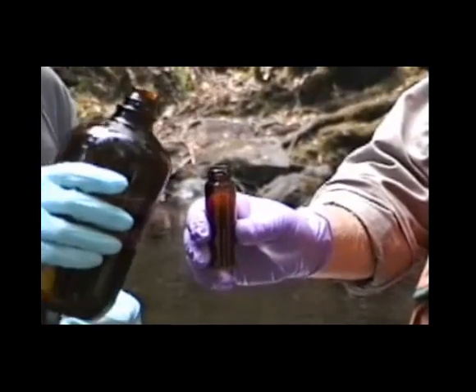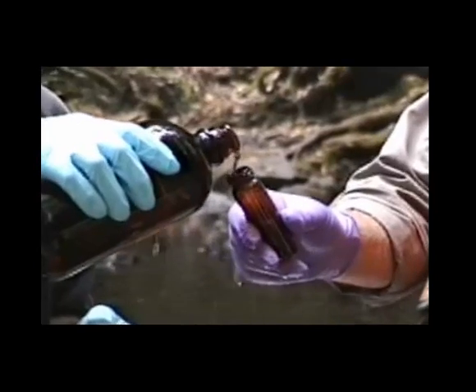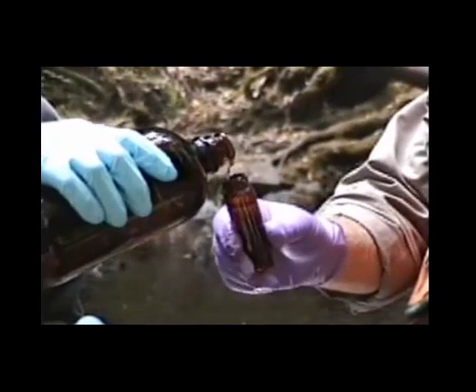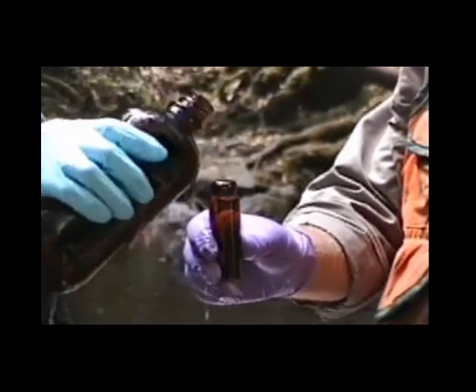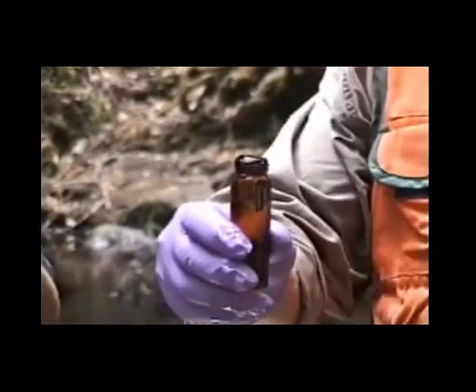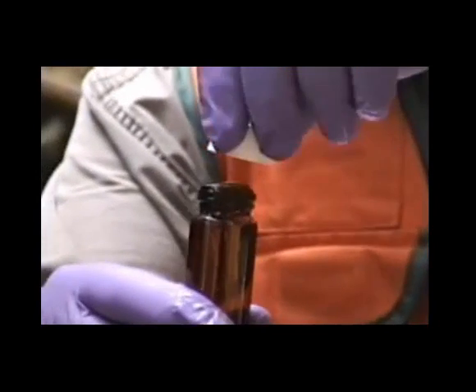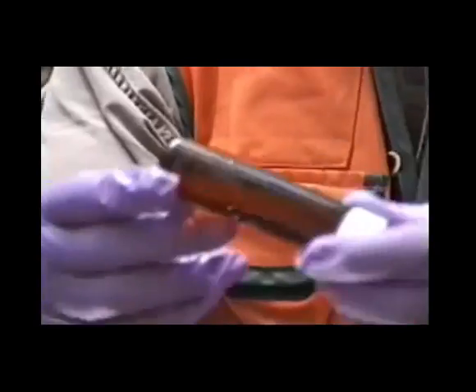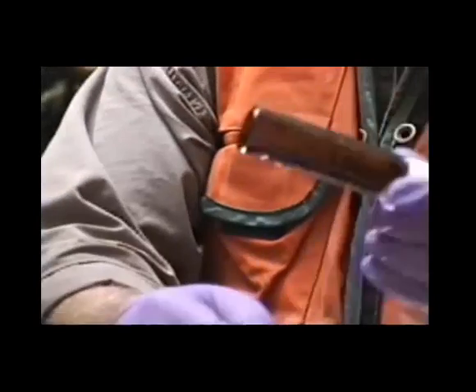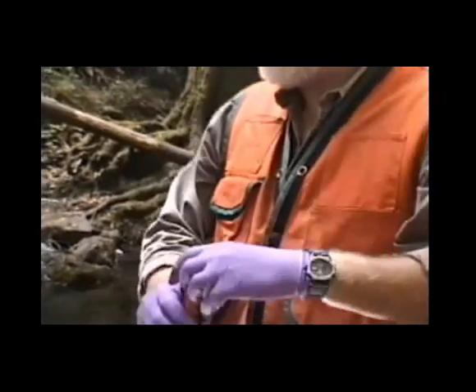We then pour the sample into the VOC vial, making sure that we don't pour any excess water over the side, pouring a meniscus on the top. The bottle is then capped, making sure there's no airspace in the bottle. It's then flipped over and flicked to make sure that there's no bubbles in the bottle. The sample is complete.